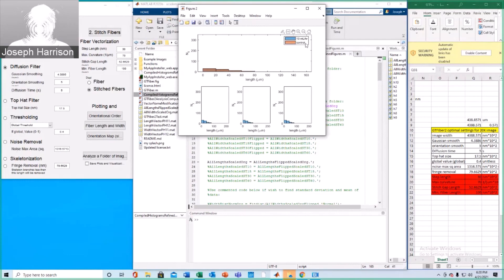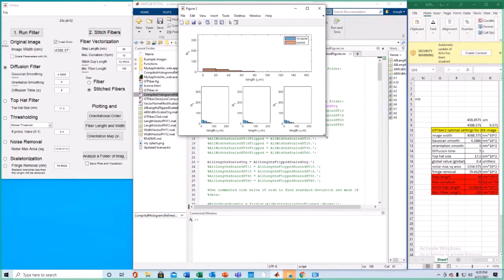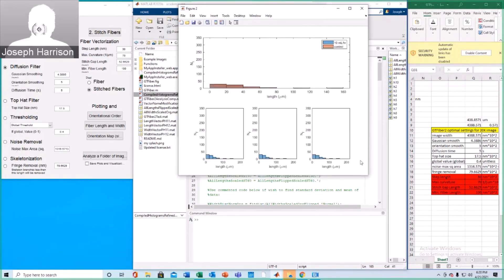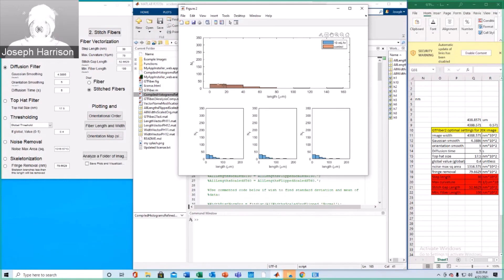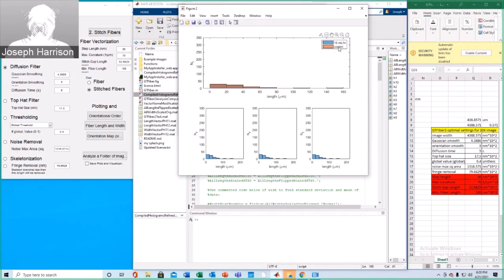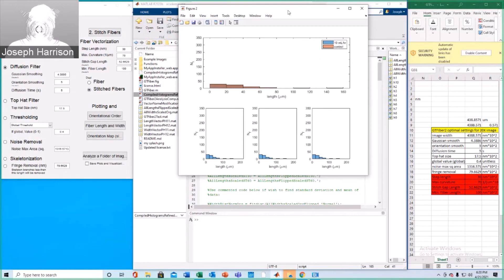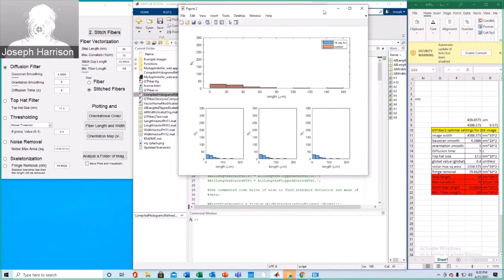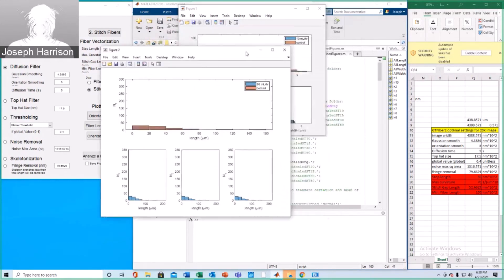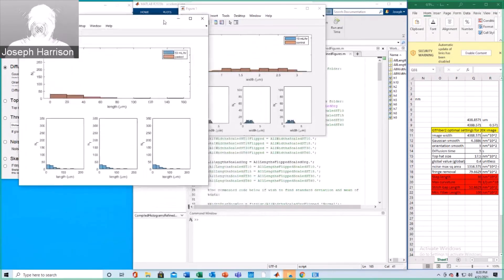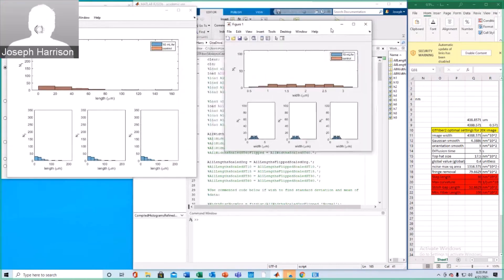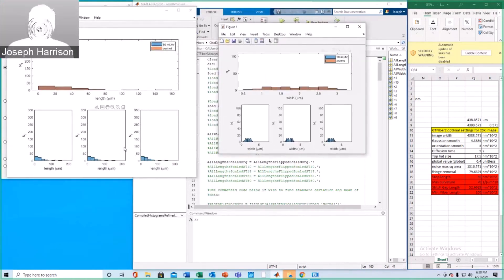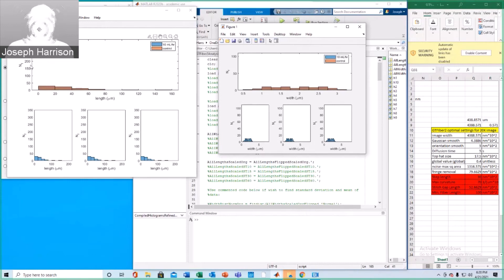Alright, these look as expected. Again, as you can see from the color change here, these are just two histograms plotted over each other that are identical because I didn't analyze two folders. This isn't actually 10 ml per hour, it's two control groups. But yeah, this would be the length and this would be the width generated. In general, this is the format used for the histograms in the paper.